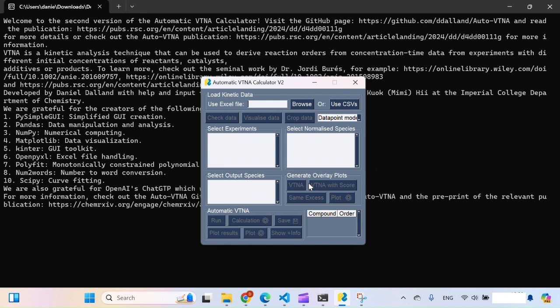Another change I've added is that if you input a dataset which has some errors with it, then you will not be allowed to start a calculation. So this prevents the app from crashing and informs the user about what needs to be addressed, for example, negative data points or inconsistent column titles in the input data, as I described in the previous video.